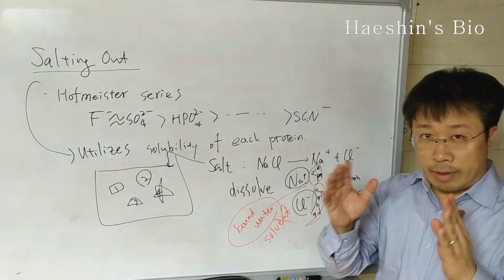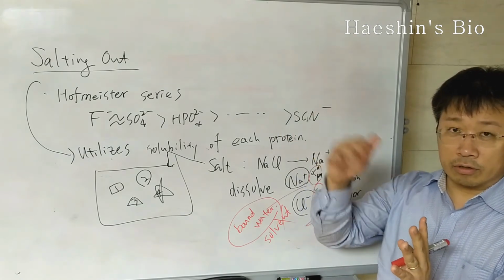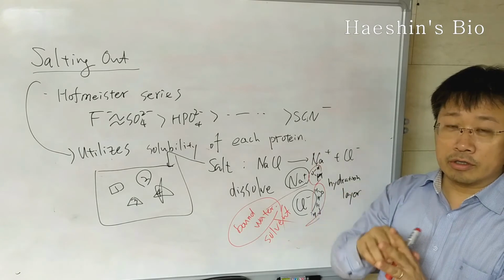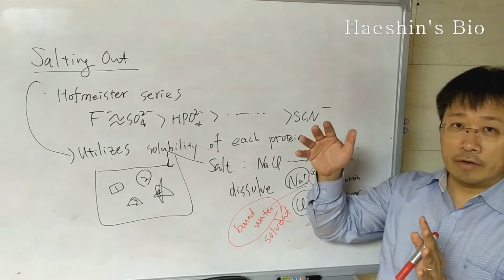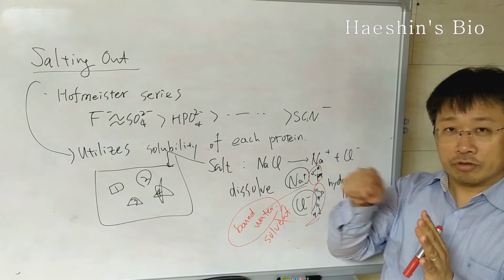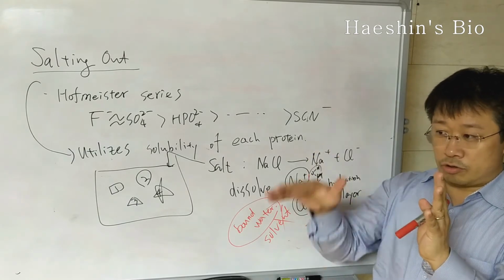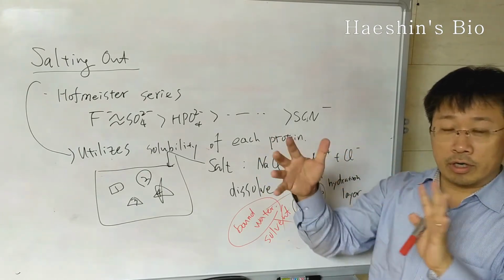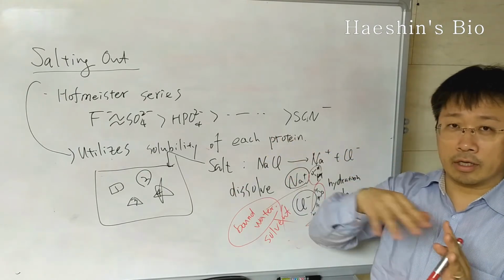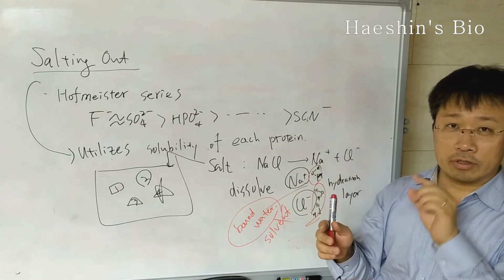Imagine you have a certain volume of water and you put in a lot of salt or a lot of sugar. At a certain point, even if you add more sugar, it does not dissolve and powder comes to the bottom. But you still see water, it still looks like water because it flows at room temperature, perfectly like water except for the sweet taste.